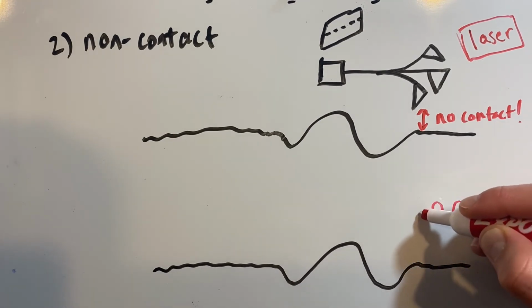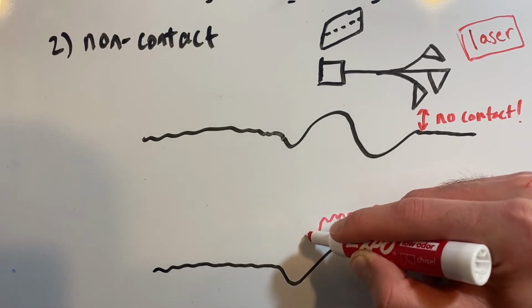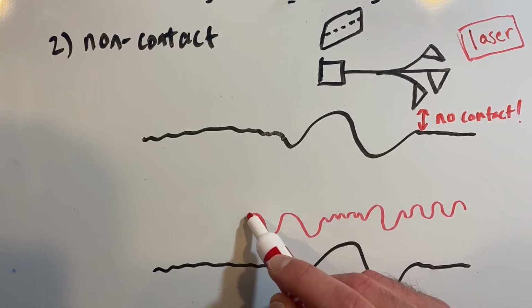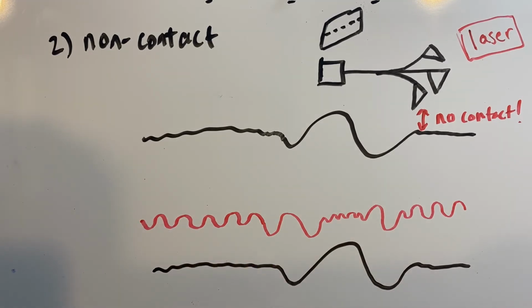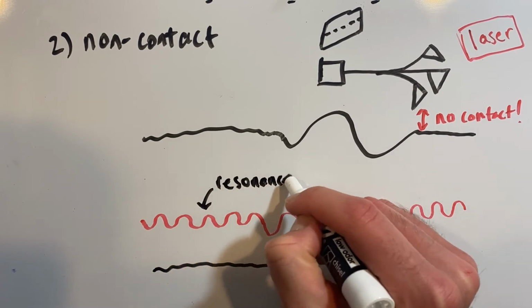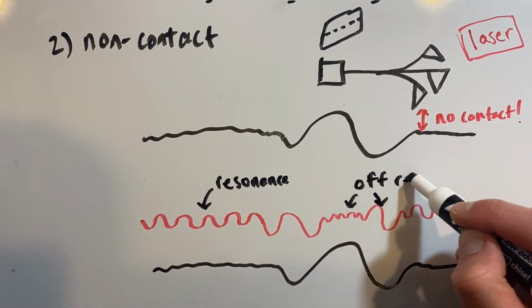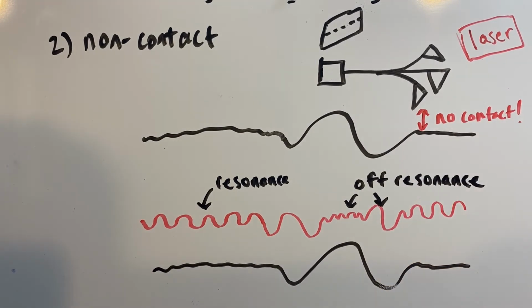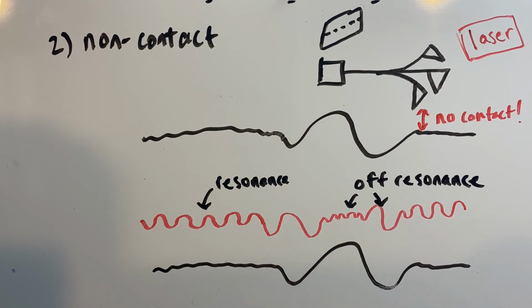Now, in order to obtain the topographical information of the surface, the frequency and amplitude of the oscillations of the tip are monitored. When the tip is over a flat location that is at the equilibrium position, it oscillates at its resonance frequency, whereas when it encounters a peak or a valley, it oscillates at a different frequency with a different amplitude that indicates the location.